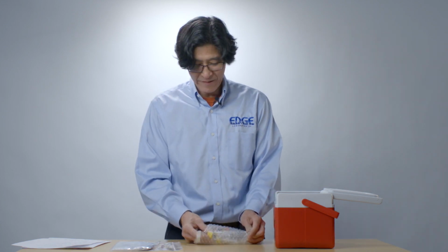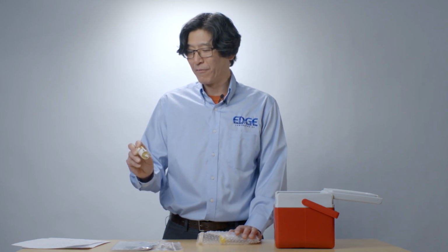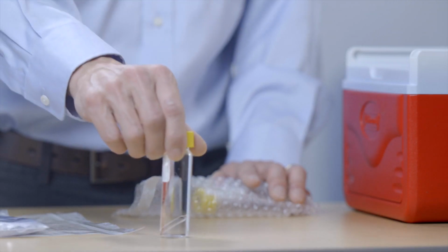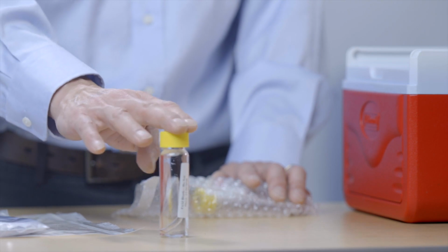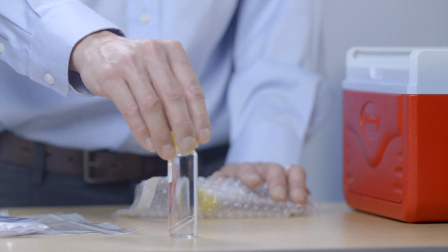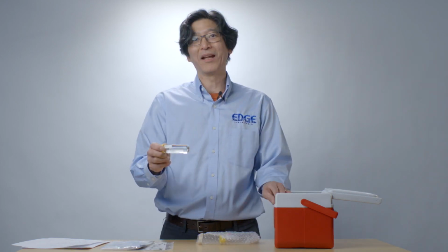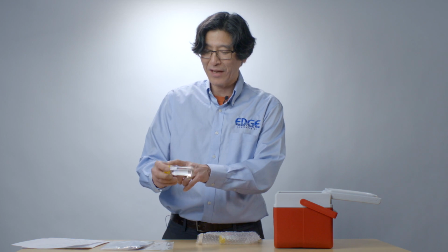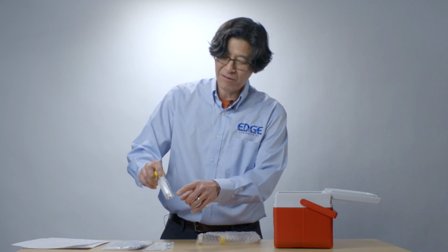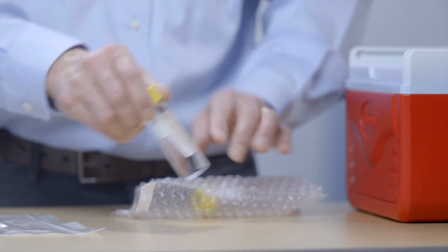One of these vials is what we call the field blank. It's already filled with water, and this goes along for the ride. We don't do anything with this. It is to check for cross-contamination in case there are any detections. But this is a good example of what a sample should look like. It's filled to the top, there are no air bubbles, and there's this little glass insert inside of here. This has the HCl preservative.